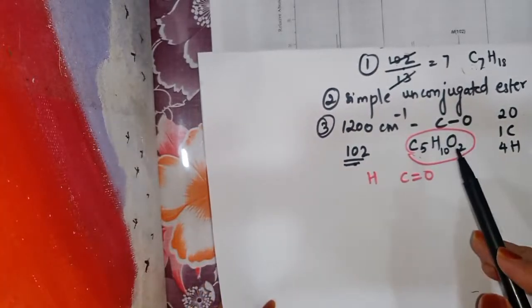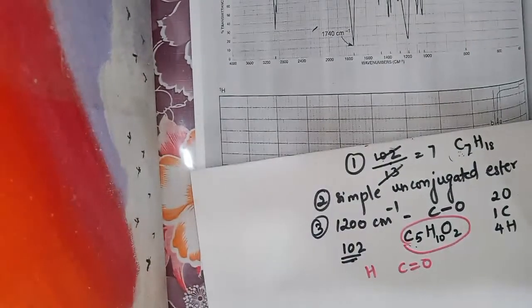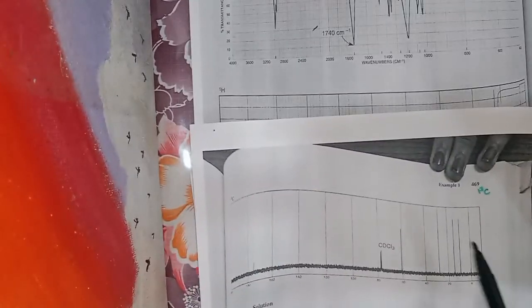Okay. Now let us see the C13 NMR. This is the C13 NMR.